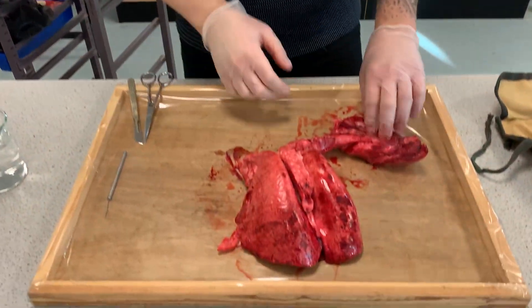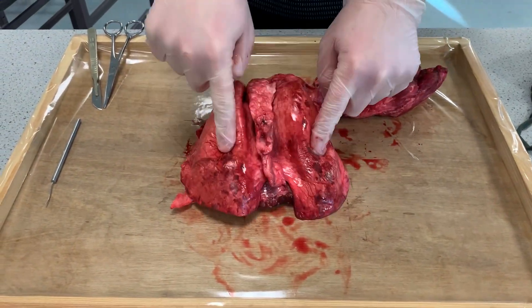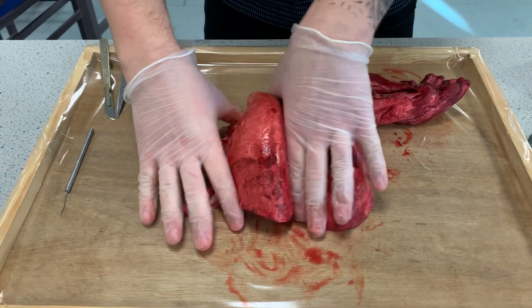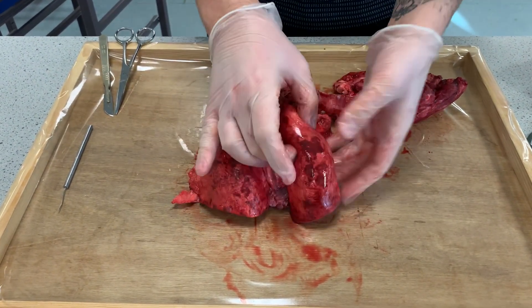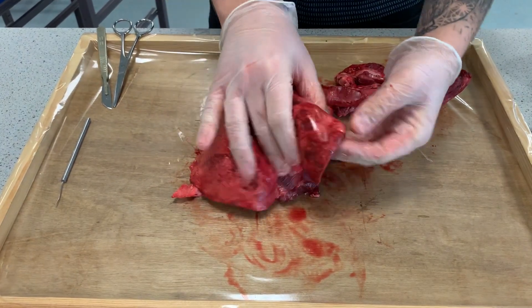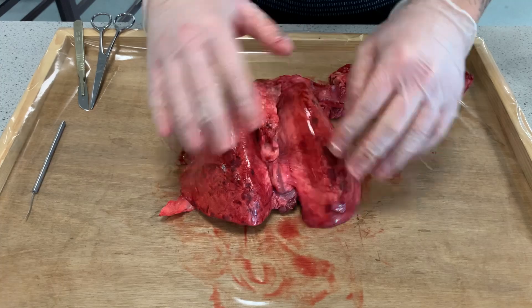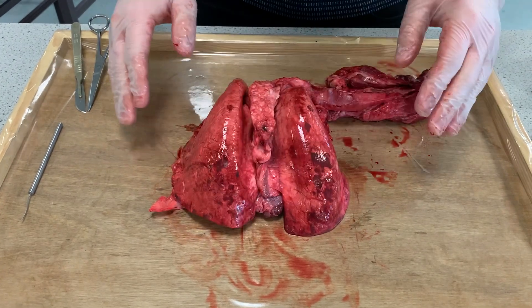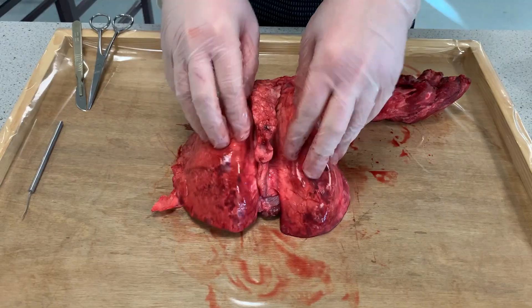So the different structures of the lungs. Firstly, you have the two lungs — this bit here and this bit here. If I have a look at this, it's nice and squidgy, flops around a little bit and actually works. It's very, very spongy when you feel it. We'll have a look at that in a minute.